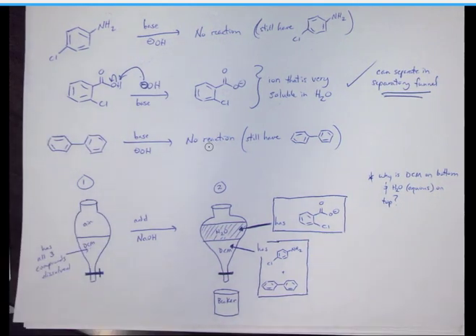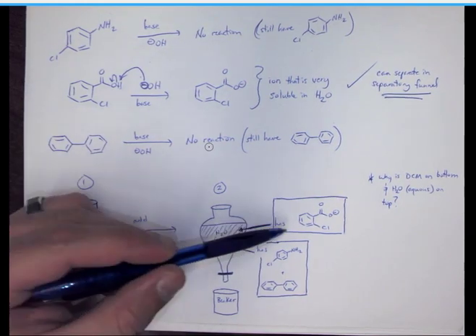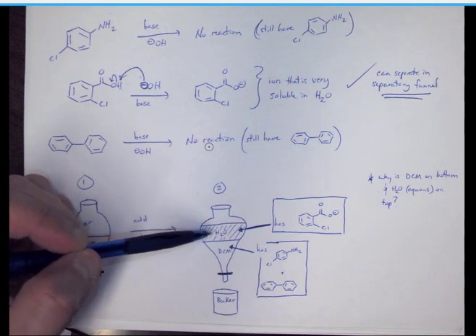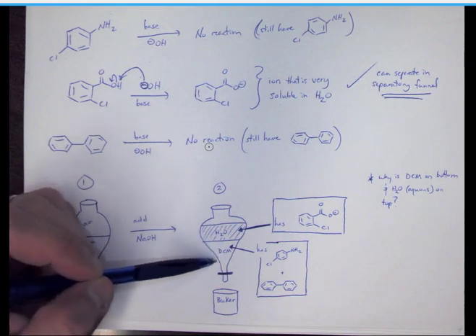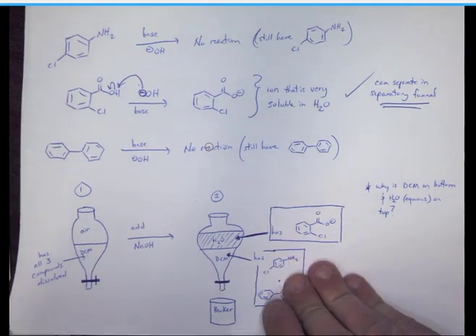Okay, now one thing to also understand here in this reaction: yes, we are going to see that this ionic form of the acid is going to be much more soluble in water, but some of it could stay behind in our organic phase, and the reason behind that is something called the partition coefficient.